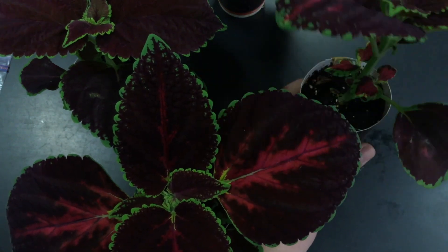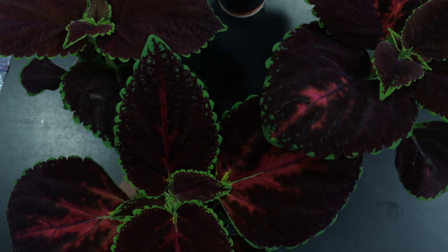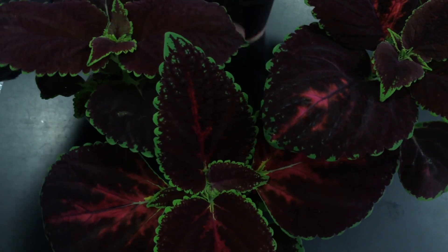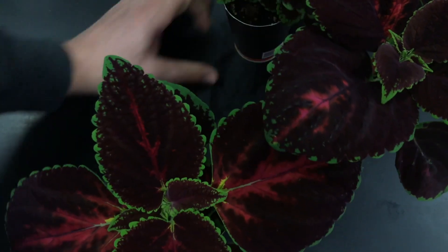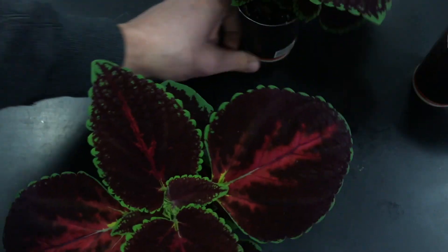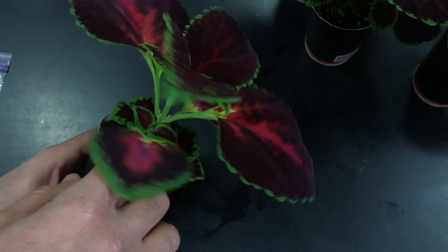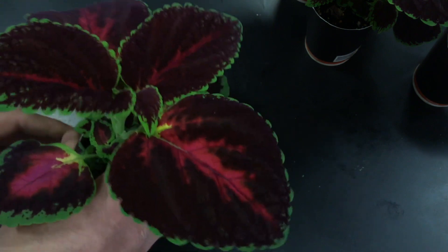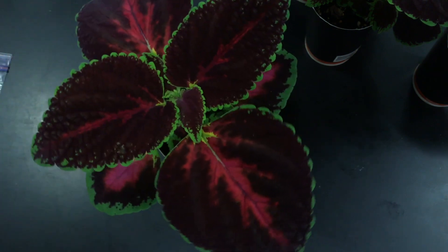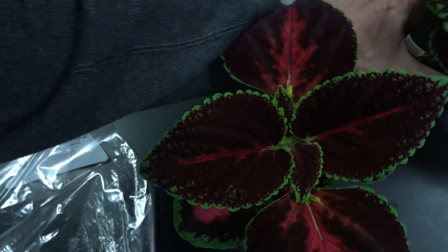Since we're going to measure the rate of water loss, we need to make sure the water doesn't evaporate from the top of the plant pot or soil. So we're going to bag these plants. I have four plants — one being the control, which will be under 12-hour light. The idea is to make sure there's no evaporation from the soil, so that all transpiration occurs from the leaves.